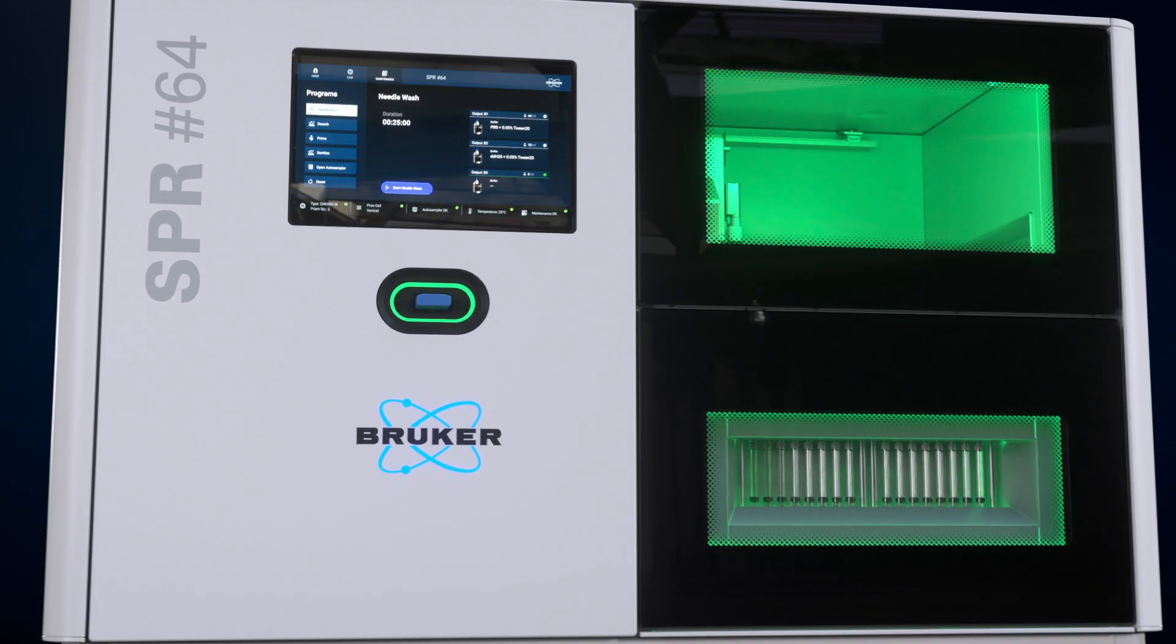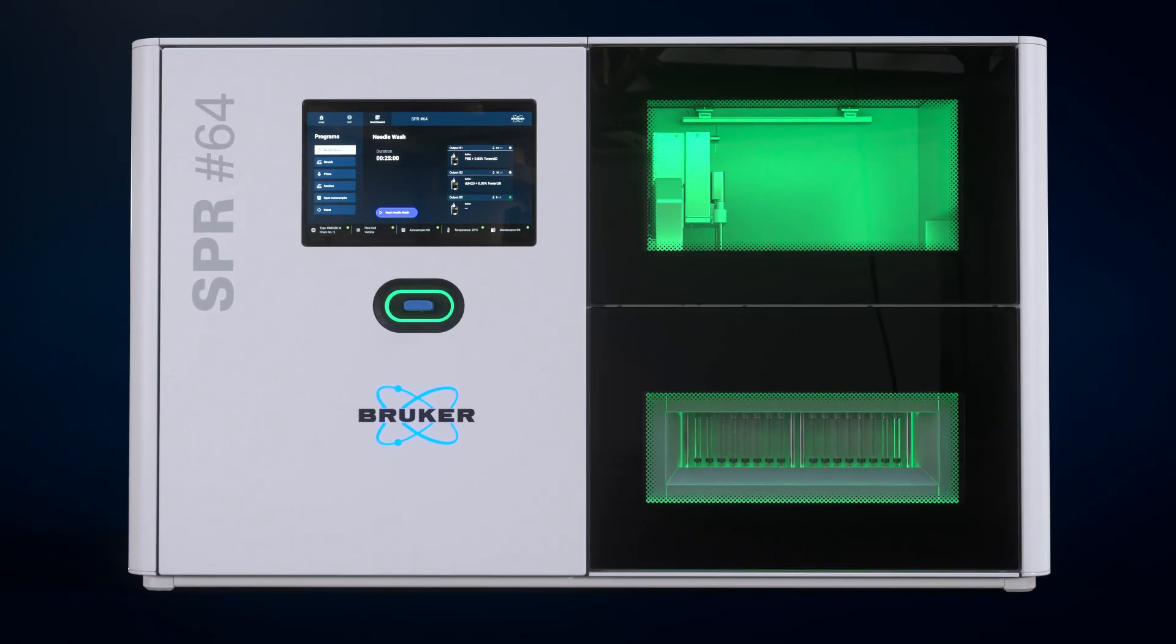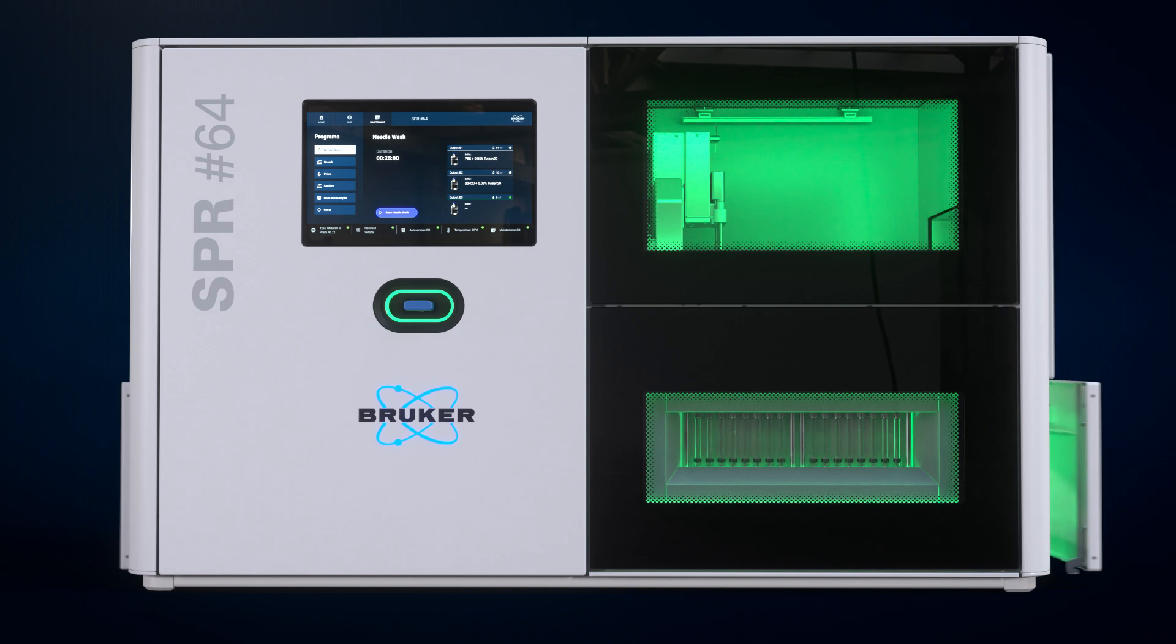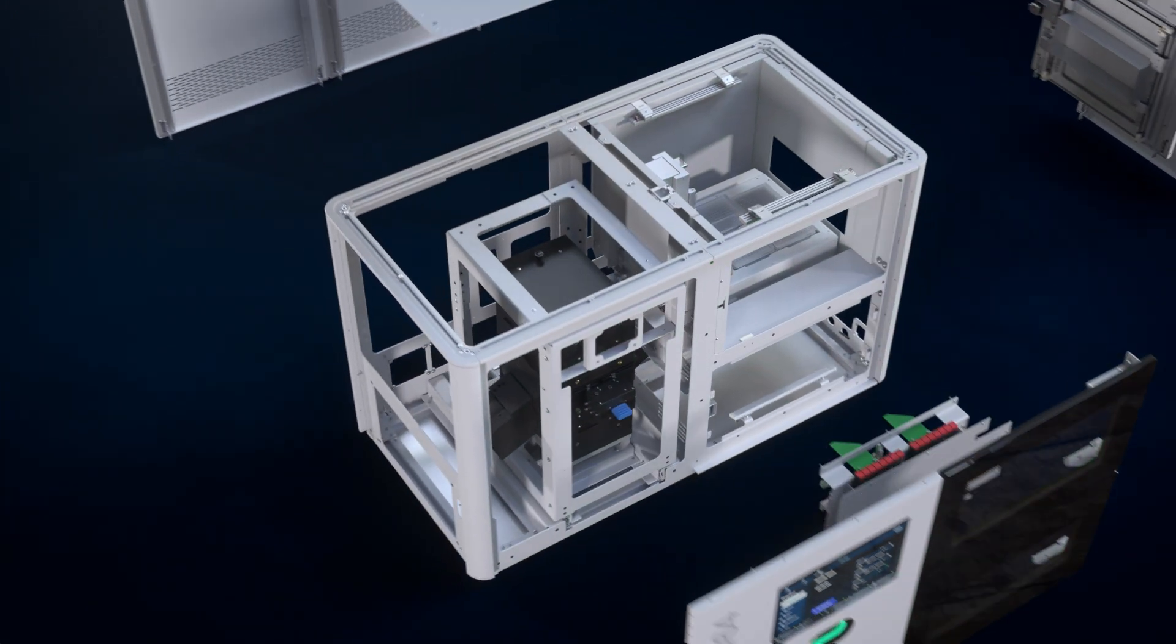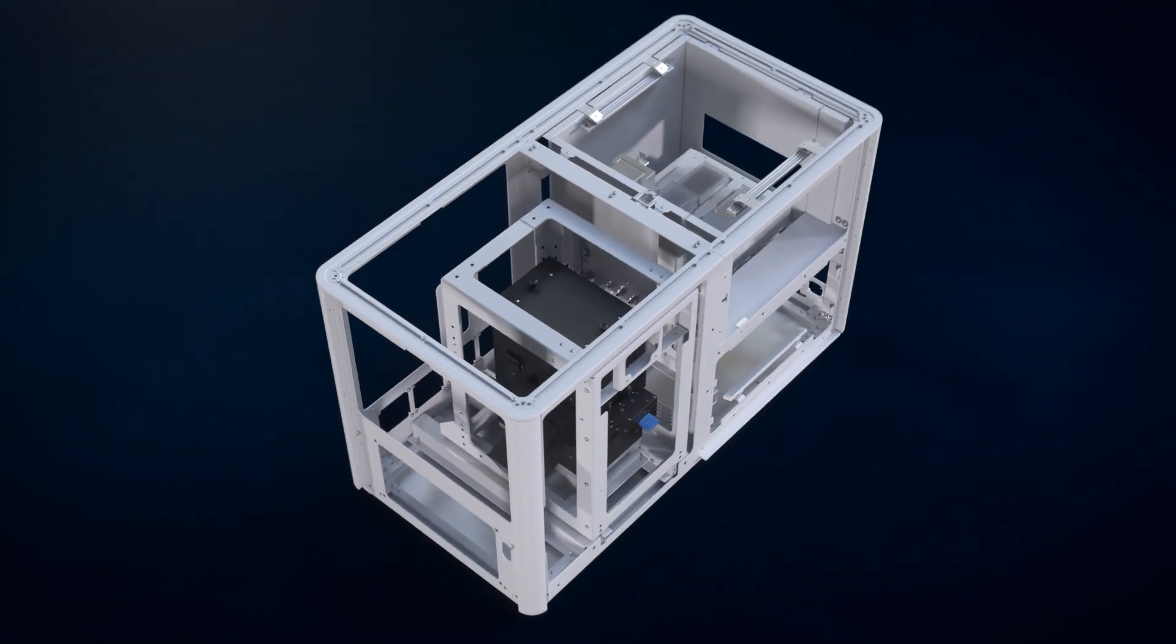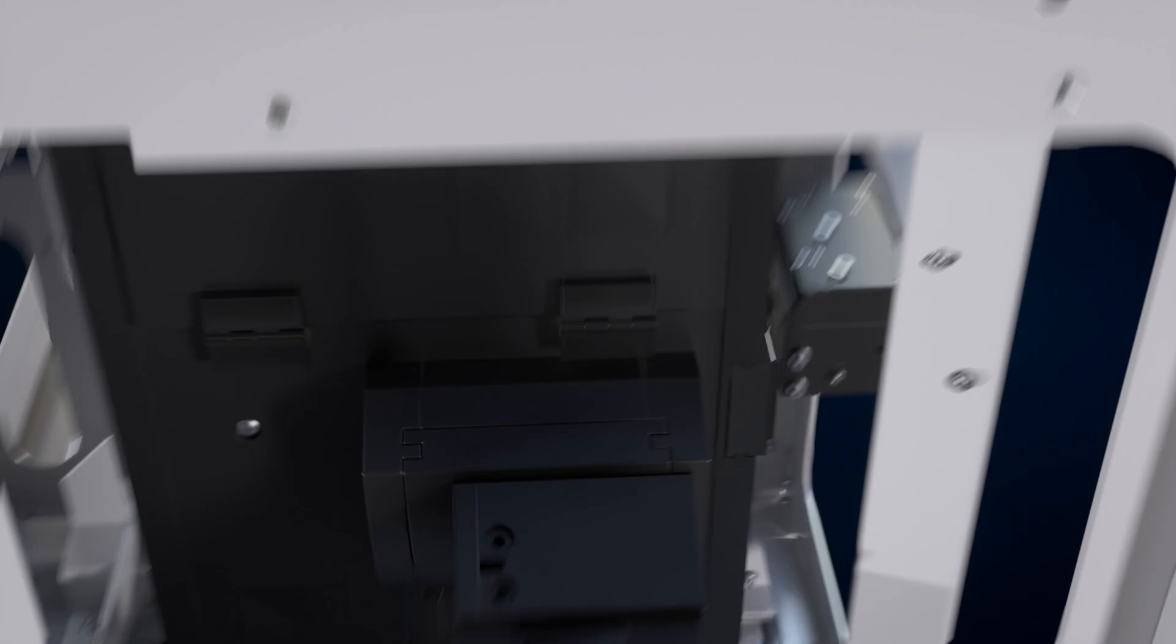A precise microfluidic setup allows the perpendicular addressing of 8 samples at a time, allowing the simultaneous readout of 64 sensor spots.